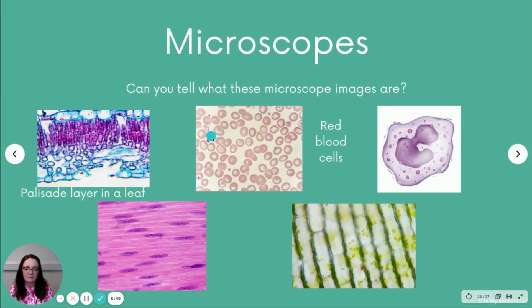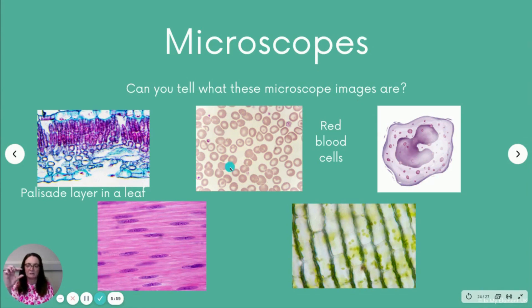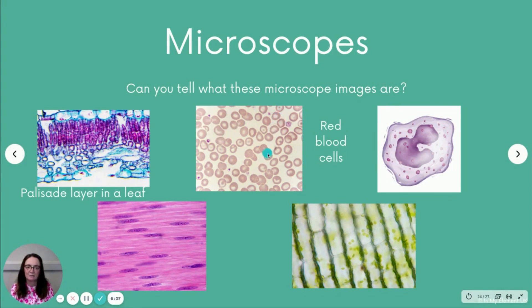Next, red blood cells. You can see where it's lighter in the middle — that's the indent where it's concave, where it goes in in the middle. Remember there's no nucleus, although on some of these it looks like there is, but that's just the angle at which the image is taken.